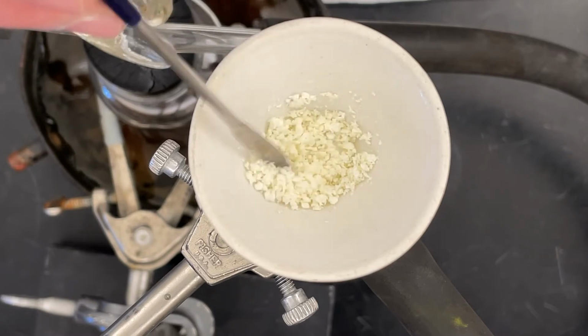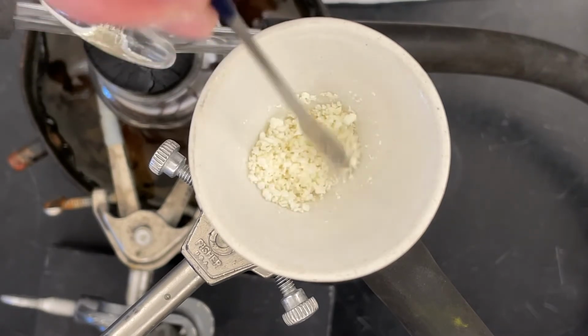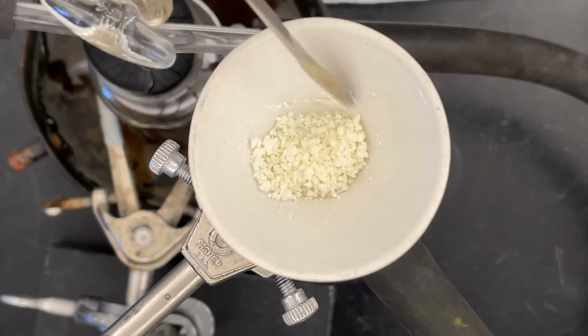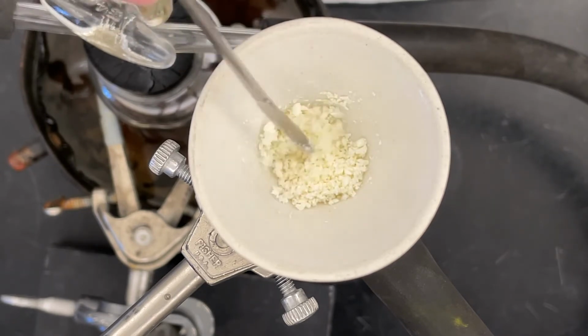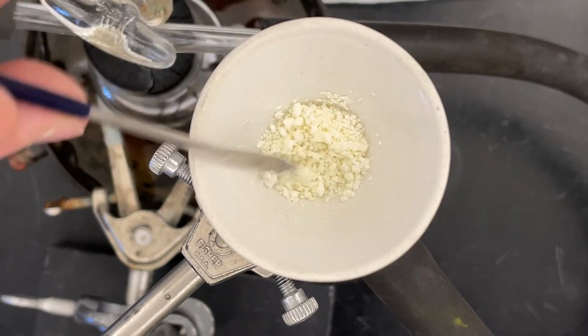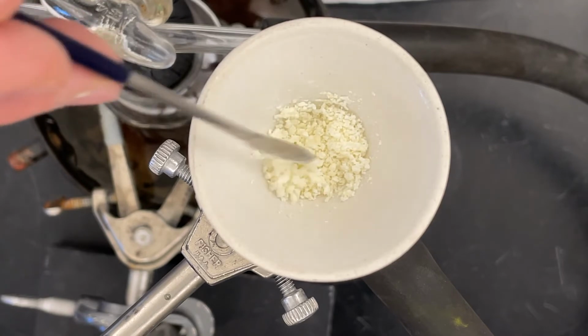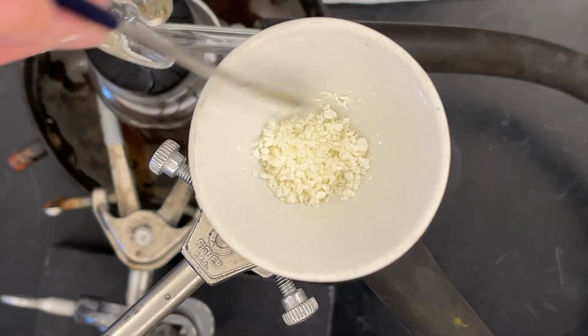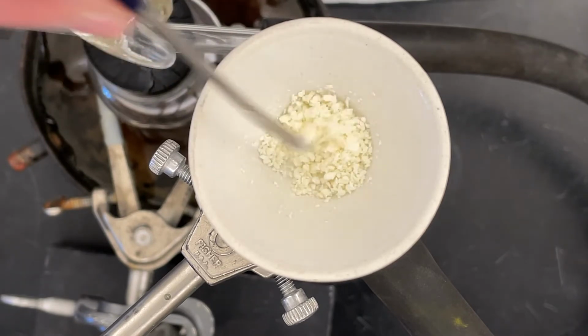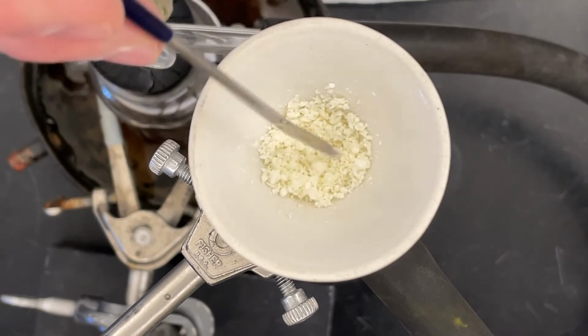Now, it's still going to weigh heavy. It's still going to have a lot of water in it. But we're going to weigh it. We'll get a weight on it today. And then we're going to let it dry for a bit before we do the recrystallization so that we can really get a yield on this reaction and then a good number on our percent recovery on our recrystallization. So I'm going to stop messing with it now, and we'll go get a weight on that petri dish. We'll come back, we'll take this guy off.